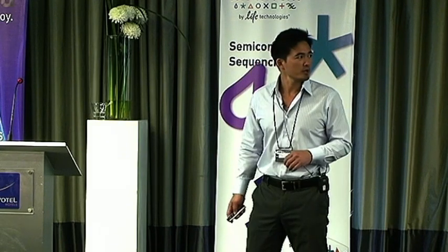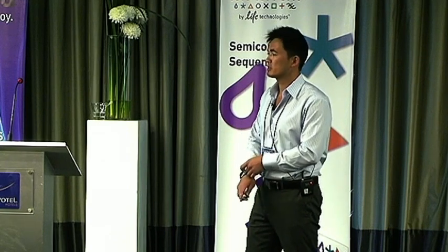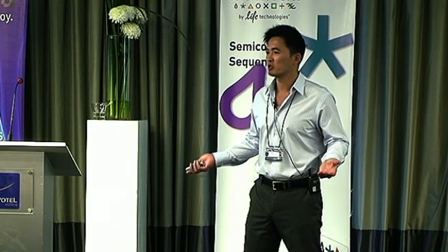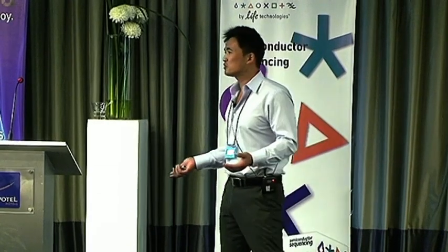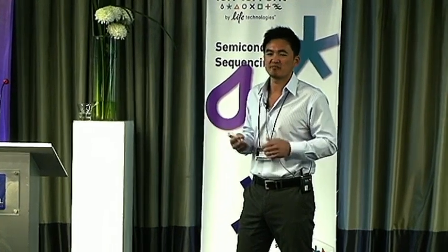Let me jump off here a little bit and talk about digital PCR. First of all, who's familiar with digital PCR? Has anyone heard of digital? Nobody? Okay, so digital PCR is something relatively new, and it's something that's getting a lot of buzz, a lot of interest in the research community.